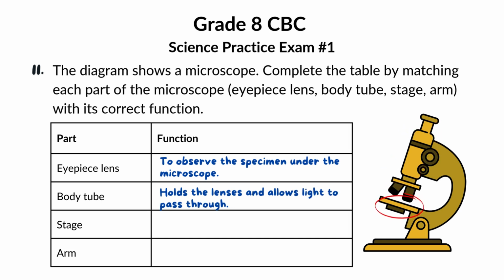Now, let's move to the stage. This is where the action happens. It's the platform where you place your slide with the specimen you want to observe.